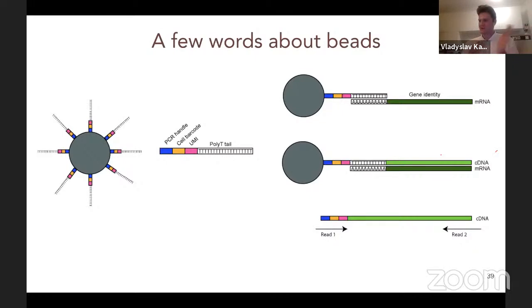So basically the question that you are asking us is, can a UMI-based method bring a batch effect with itself? Of course it can. I mean, it depends on your sample processing, and it depends on the number of cycles you are using. And at the end, the only way to avoid batch effect would be to standardize all of the protocols that you are using. Sounds like a tough task, isn't it?